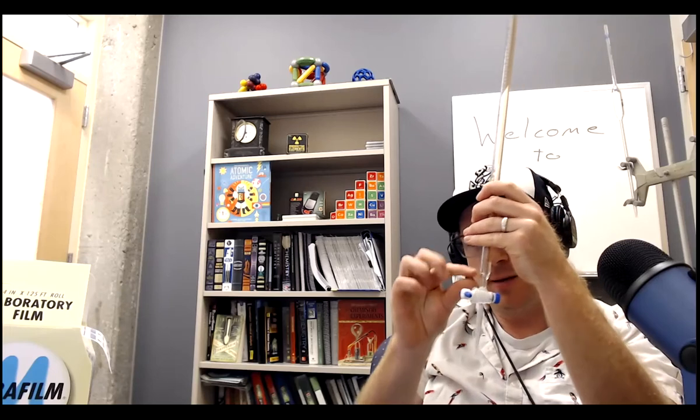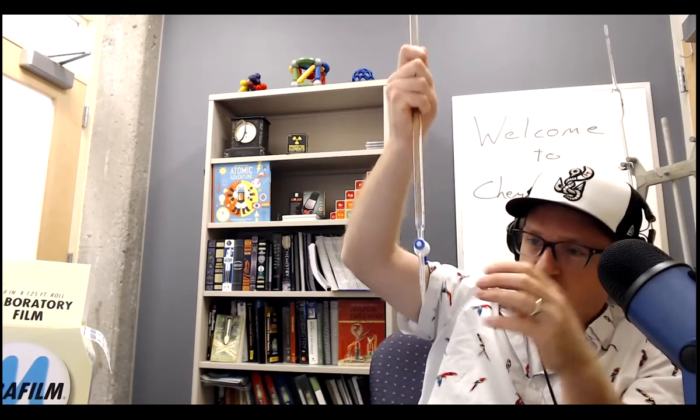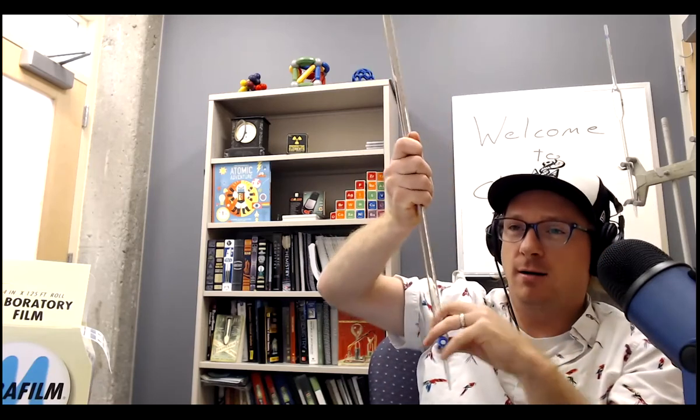Again, you want to make sure there's no bubbles here. If there's a bubble in the tip or in here, open it up, let that bubble go straight into waste, close it up, and then fill it back up to 0. Hopefully you don't need to drain the whole thing. Sometimes a bubble will get stuck there and you open it up and you might have to shake it down over your waste to get the solution to push the bubble out.